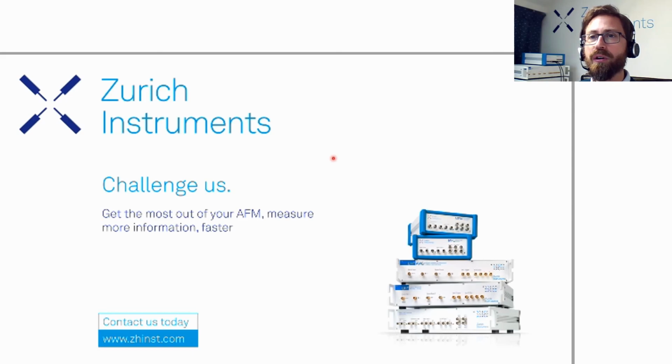Yes, what's the effect of the Z limit on FM-KPFM? I guess that's for me. I'm not sure exactly what the question meant. Of course, I guess it depends on how close you want to be to the surface. The electrostatic force is rather long range, so you don't need to be so close to the surface.